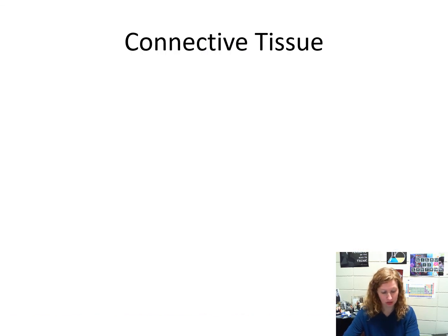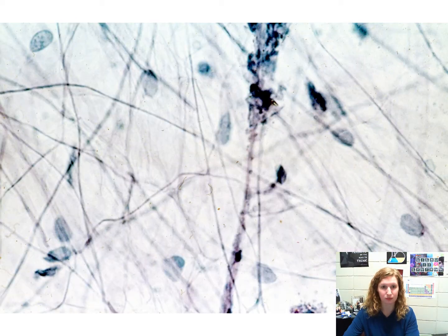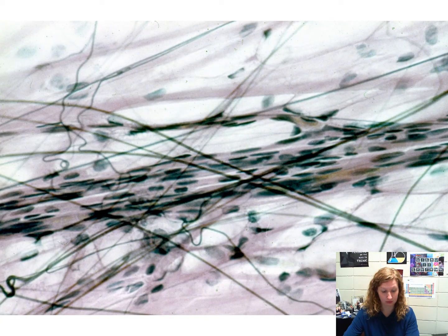Looking into connective tissue. Loose connective tissue or loose areolar connective tissue. Loose areolar connective tissue. There's a few more fibers here.